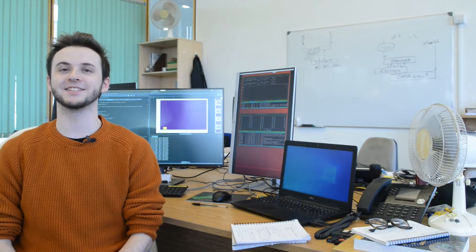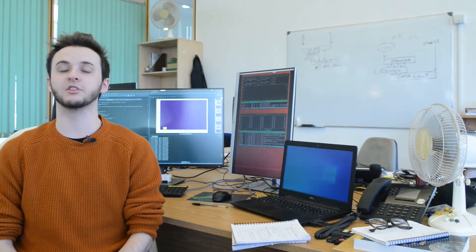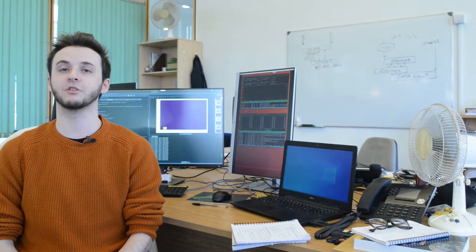The AI assist is looking for any region with important ridge detail, whether it's from a finger print or a partial palm print.